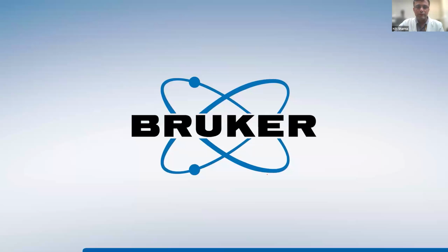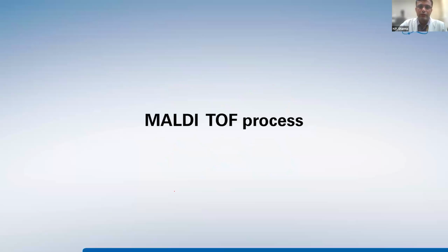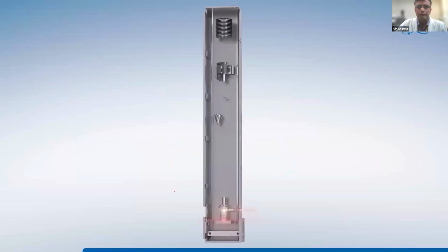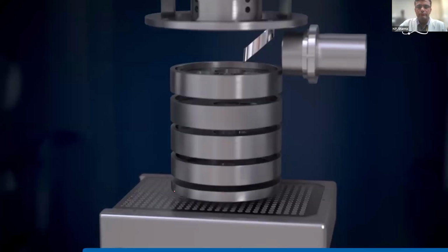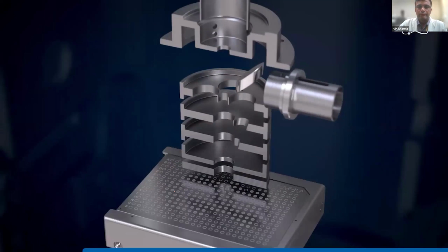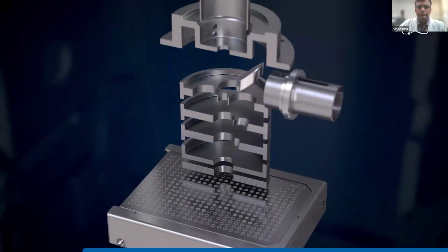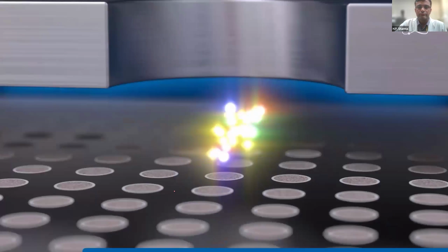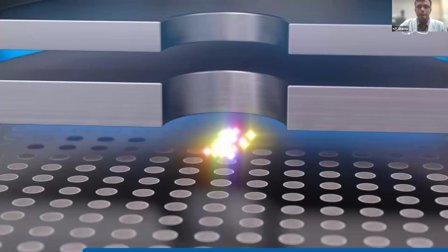And the other instrument which you are seeing here is the time of flight. The MALDI-TOF process is a 2-phase procedure. Initially, the samples are fixed in a crystalline matrix. In the initial ionization step, they're bombarded by a laser. The sample molecules vaporize into the vacuum while being ionized at the same time.